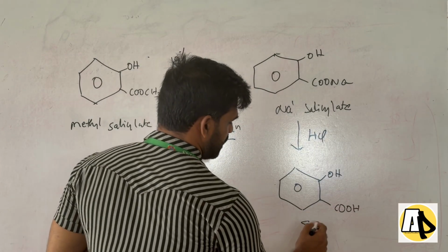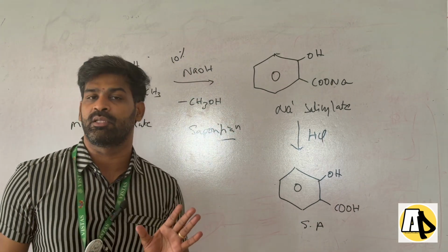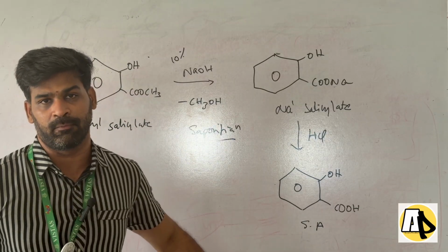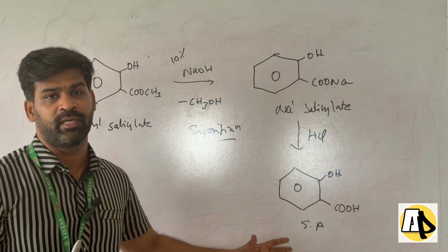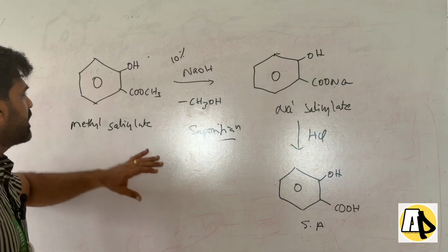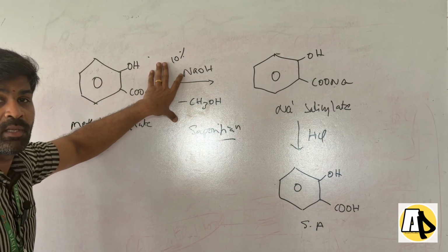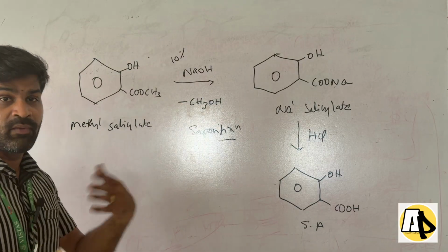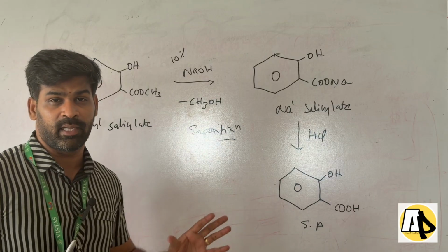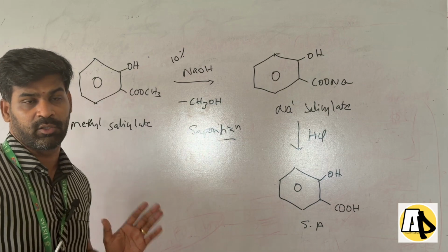Whenever you are writing in the exam, no matter practical exam or theory exam, you must write all the structures and the names of the structures also. You might have seen my previous videos, where I have stressed it very well. So this is the reaction: methyl salicylate when heated with sodium hydroxide will form this. When we do the practical experiment, I will explain clearly what the color change is, what the cloudiness is, what the precipitate is, and how the temperature changes.